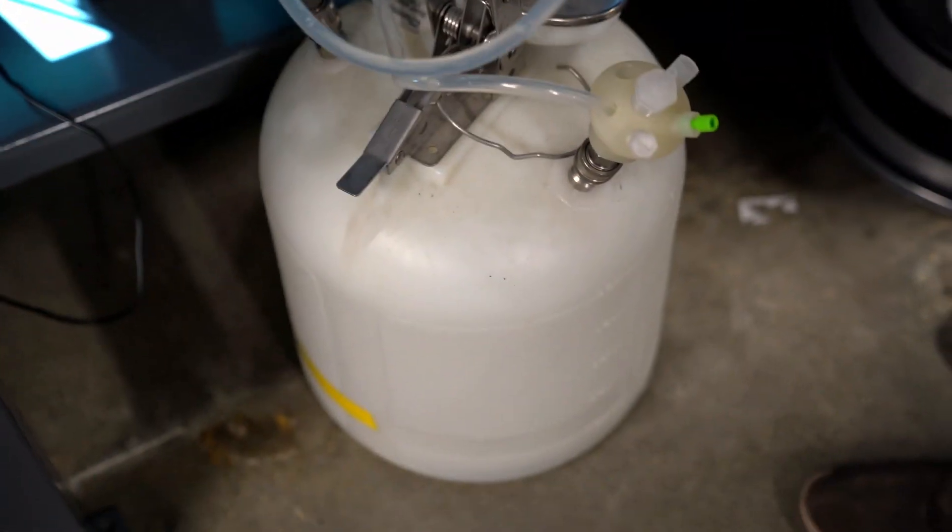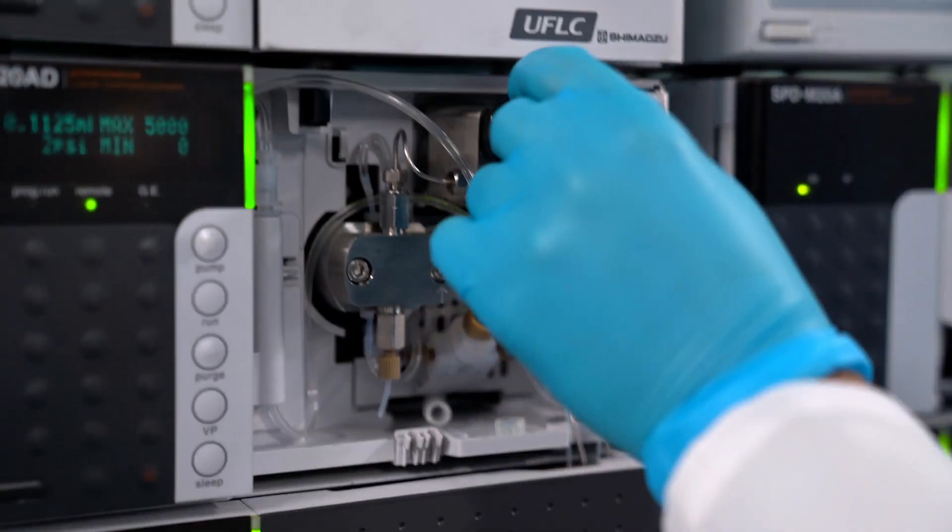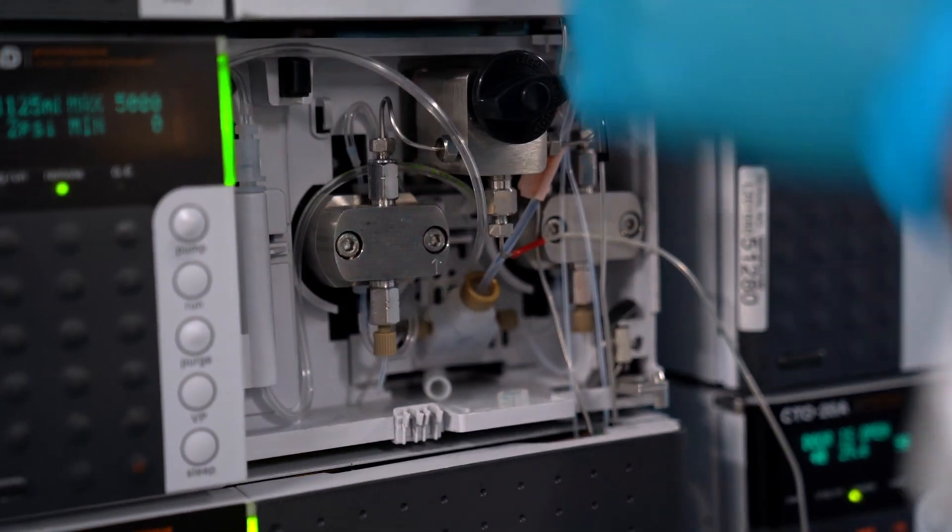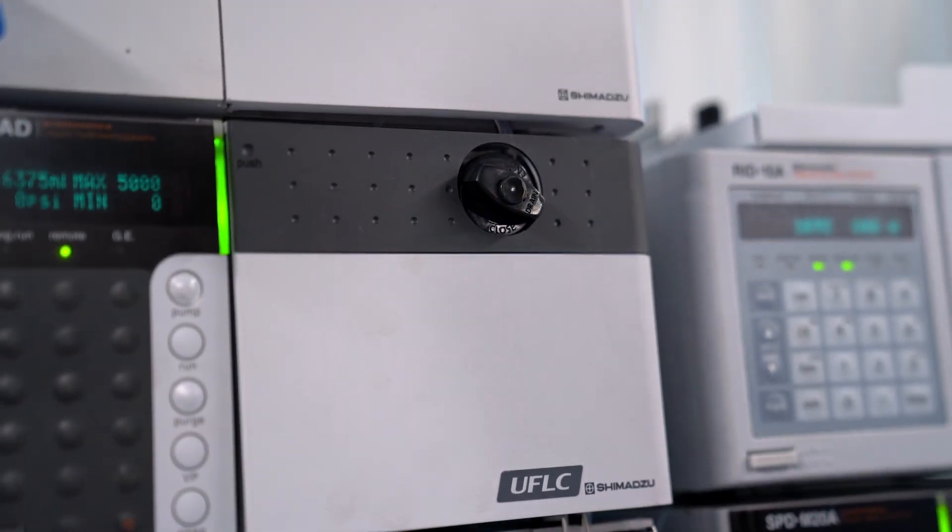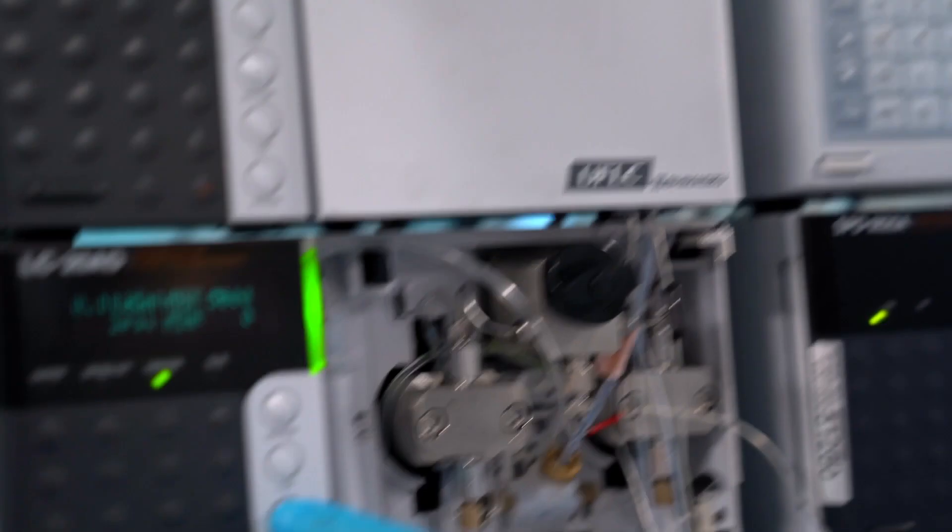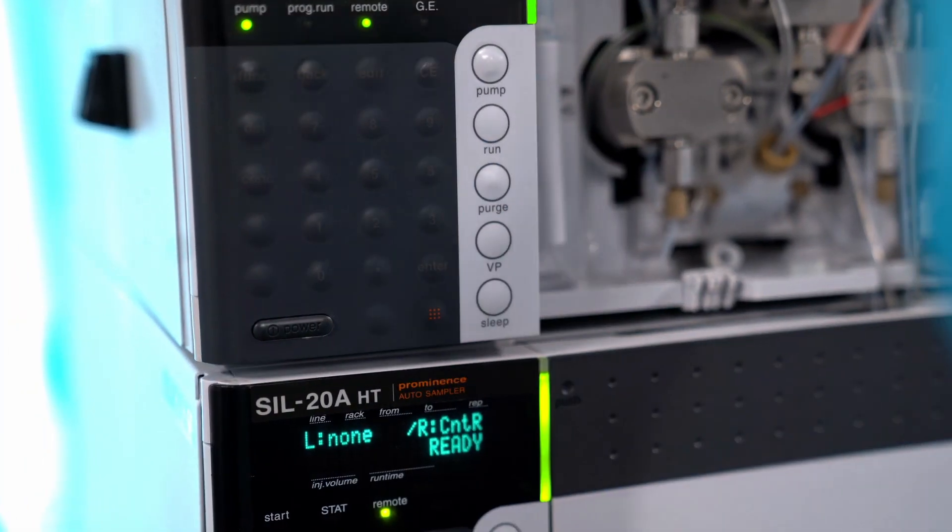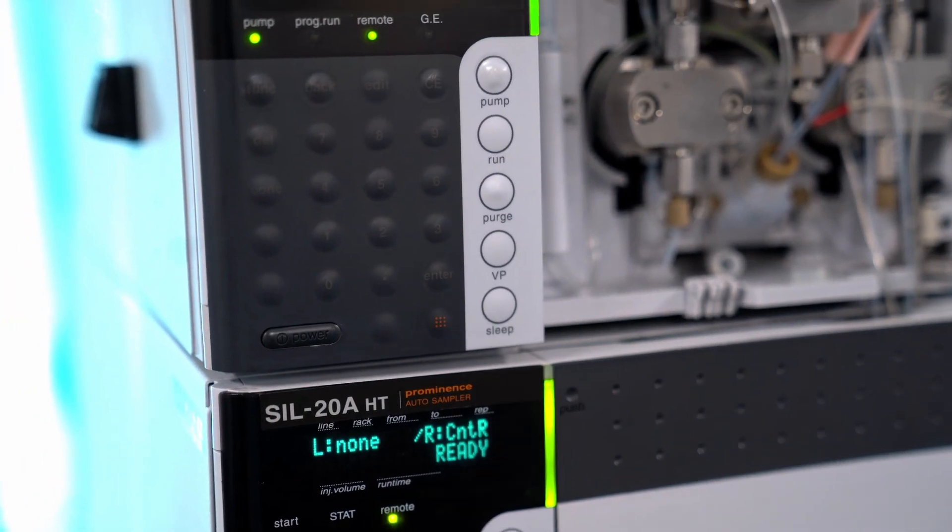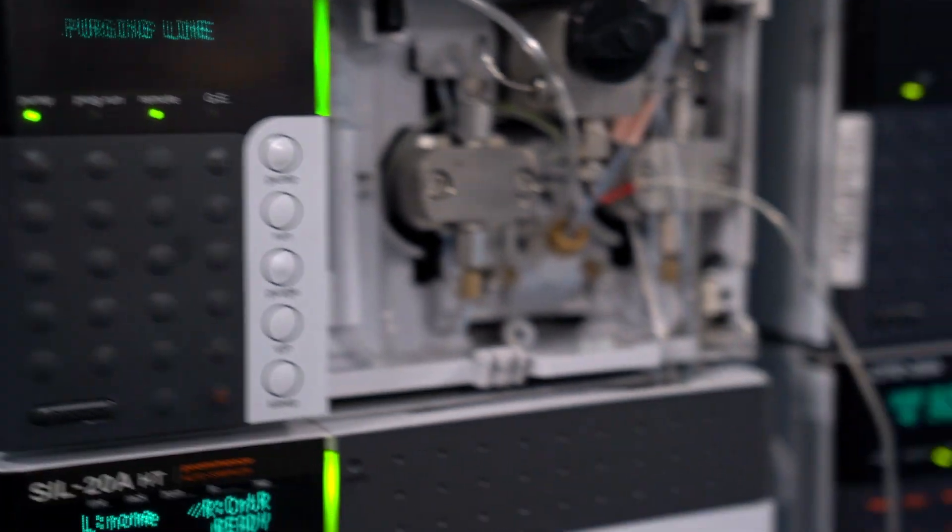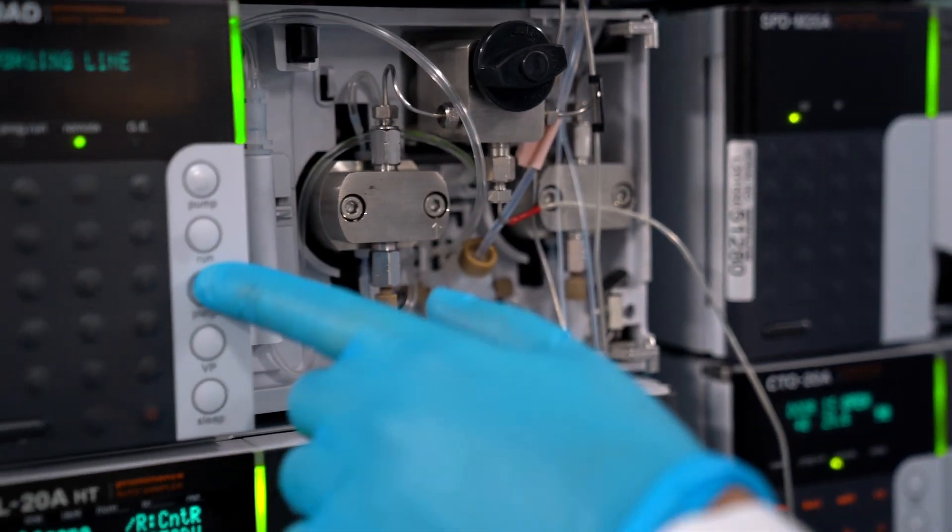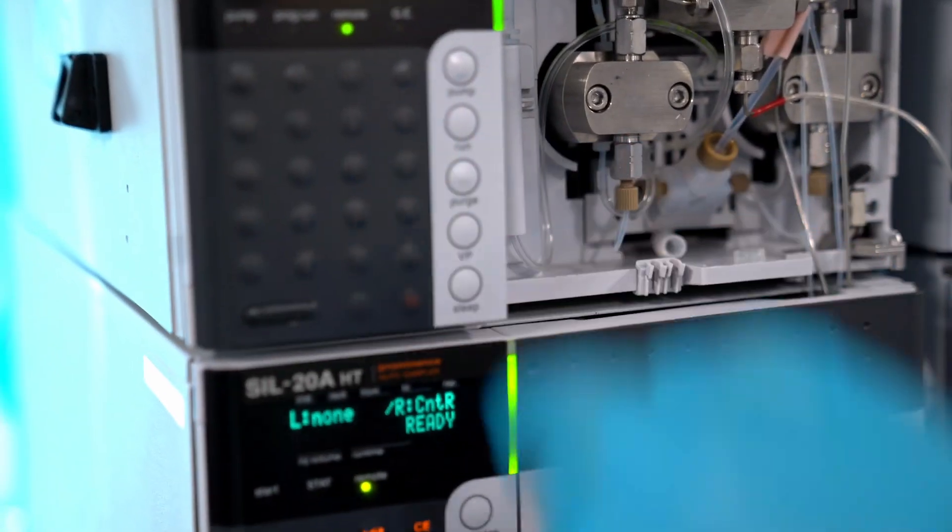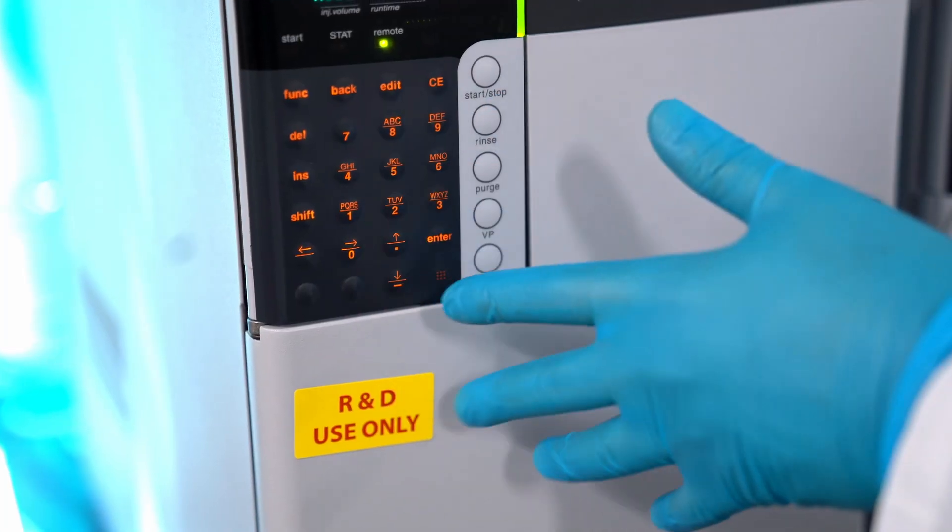Make sure that when you're purging manually that this is open like this, and then if you want to purge there's just a button up here that says purge. You can hit that and it's going to start purging, and if you want to stop the purge after a while you just hit that again.